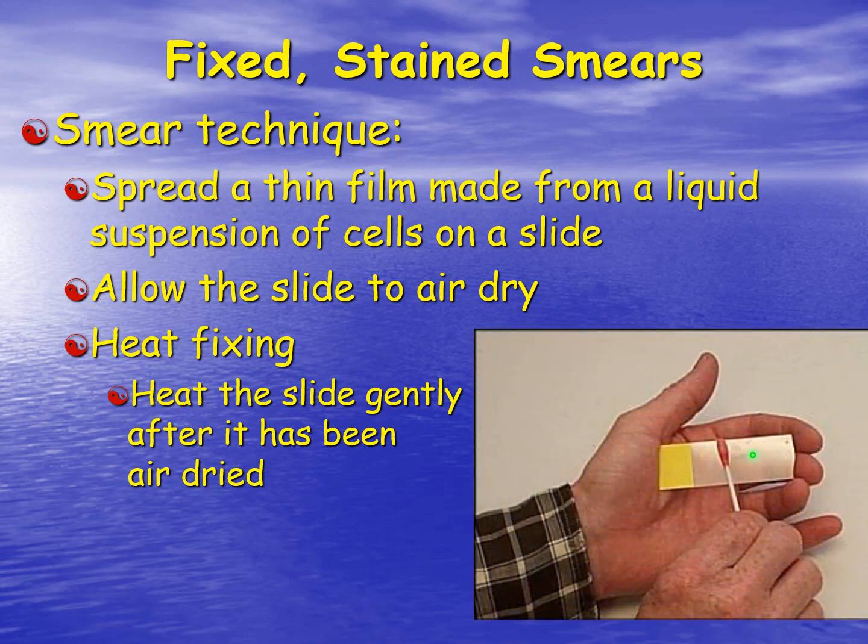And so here we're applying a thin layer. And let me state that again. You want a thin layer. The thicker layer is harder to see through, so you want very thin. And depending on whether you're using a liquid or a solid, which we can use solids, but you want to get that solid spread out very thinly.